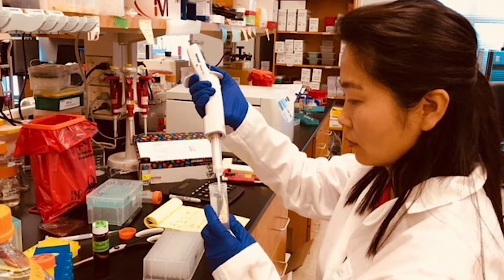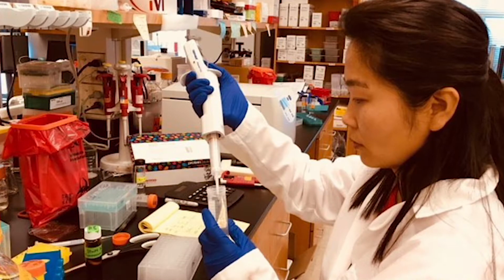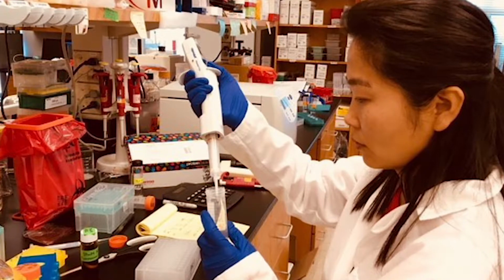We use complementary label-free and isobaric tandem mass tag approaches to quantify proteins and these complexes and these modifications in disease. One of the things that is a limitation to label-free based approaches: in general, in a 90-minute to an hour and a half, 2-hour gradient, we're only seeing about 3,000 to 4,000 proteins. And if you run multiple samples, you will have some chromatographic drift and some signal intensities that depreciate over the number of samples you run. And this leads to more missing values.